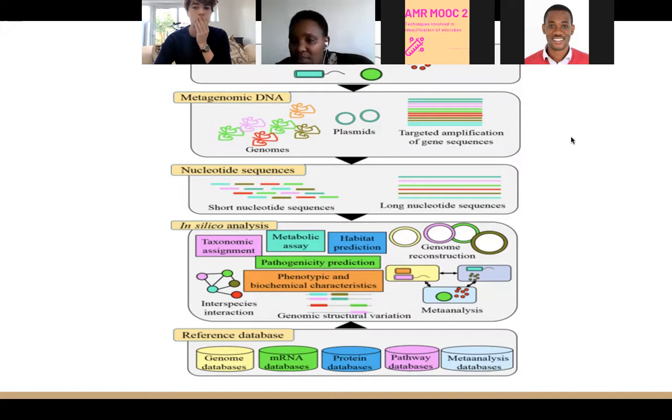You have different databases in the NCBI, for example. Here you have different reference databases, depending on your interest. So having those nucleotide sequence data, depending on your ability to work with them, you can go to the gene level and identify the genes inside your DNA. It depends on what you want to do. You can see the messenger RNA. You can get the protein sequence. You can get the amino acids and the nucleotide sequence. So you can go as far as possible, depending on your knowledge in bioinformatics, analysis of the DNA and nucleotide sequences.